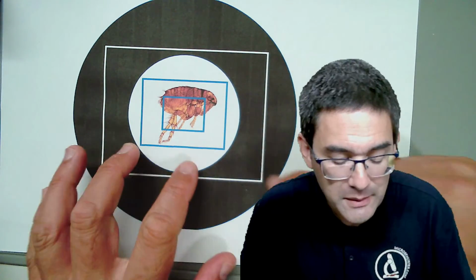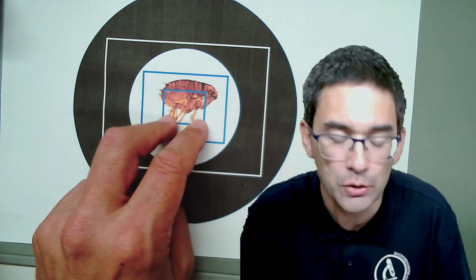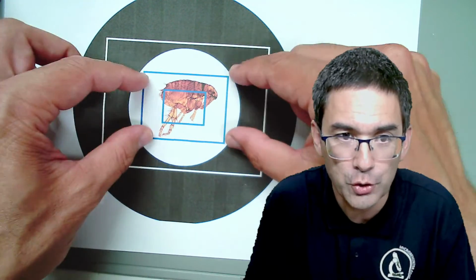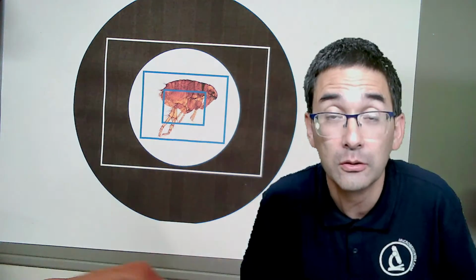Basically what this means is, if your camera has a very small field of view, you're introducing additional magnification. Because if you take the small section from the center and you make it the same size as, for example, the larger one over here, then of course this central part is going to be more magnified and it's going to look larger.